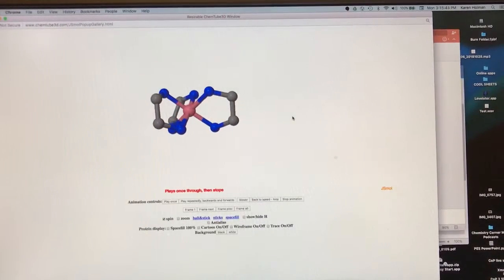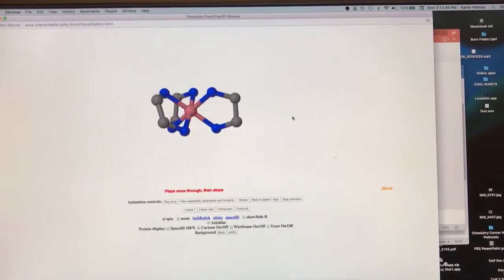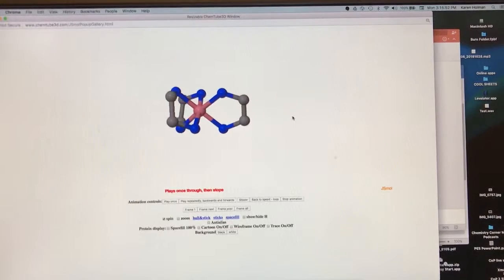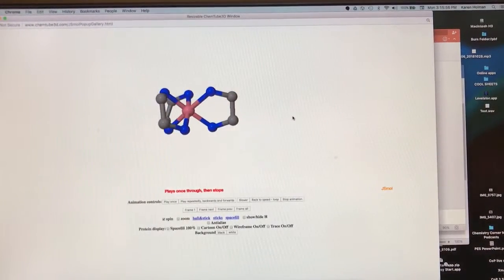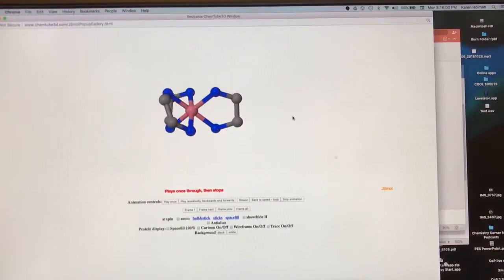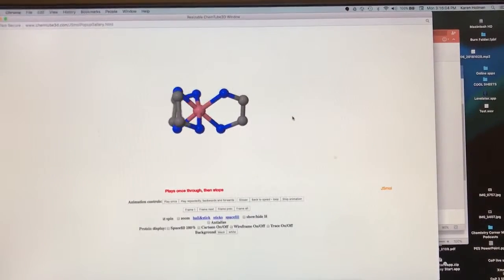Anyway, we are going to be talking about the synthesis that you're going to be doing on these lovely Cobalt-3 complexes you'll be creating, these two enantiomers. And what I have right now is a link that is on WISE. So you go within the folder, the Cobalt experiment folder, and there is a link there to this awesome website.